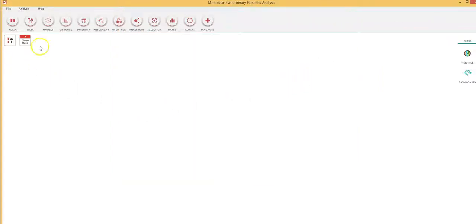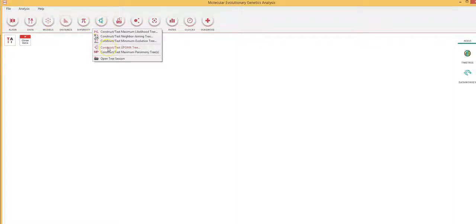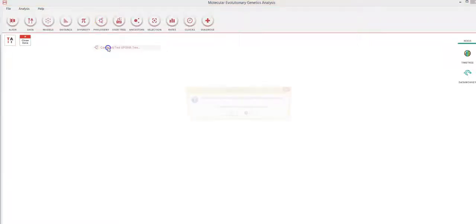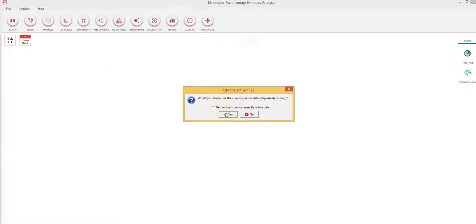Now on this window, I click on phylogeny and I construct, for instance, the UPGMA tree, which I have explained in my lecture earlier. I click on UPGMA and then I construct using the existing data file which is open on my window.